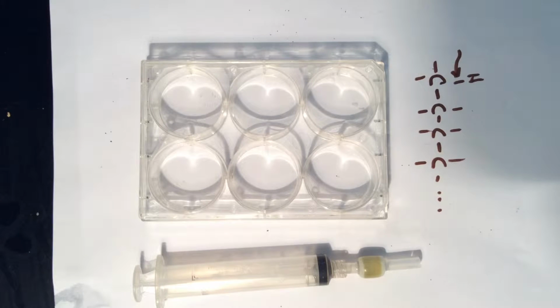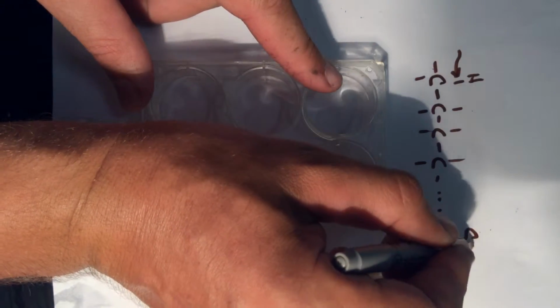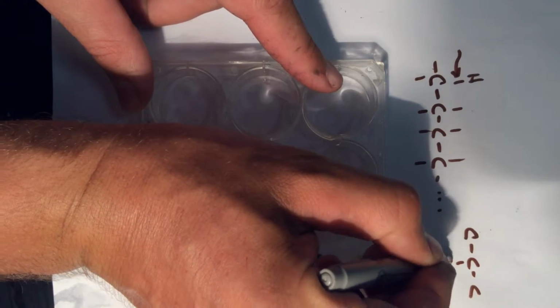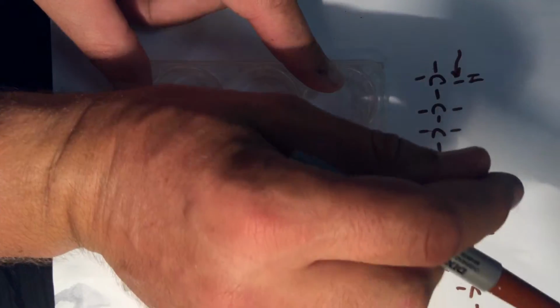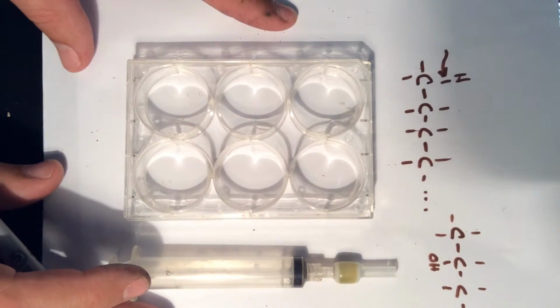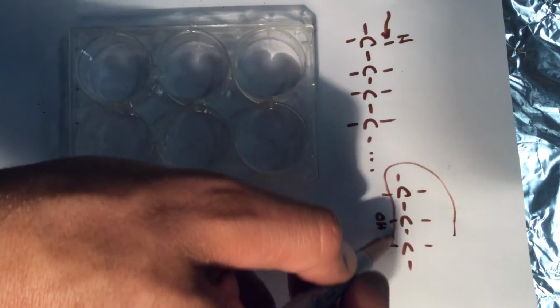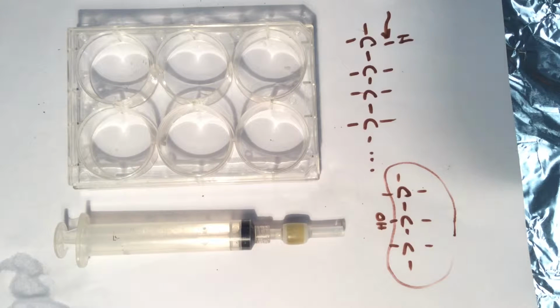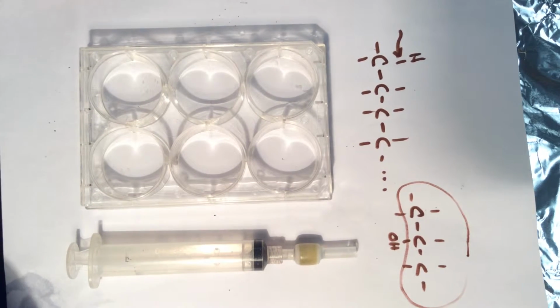The solvent we're using in our lab is hexanes and ethyl acetate, as we talked about before, but the solvent I'm using today is isopropyl alcohol. It looks like this. It's 3 carbons, that's your prop, and then we have an OH group at the bottom. So isopropyl definitely has some polar characteristics, but also understand that there are some non-polar characteristics in it as well. As we talk about, things aren't polar or non-polar, they have characteristics of both.